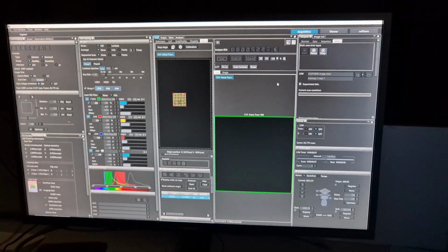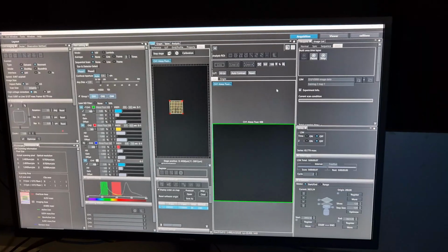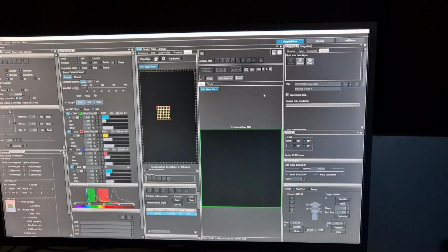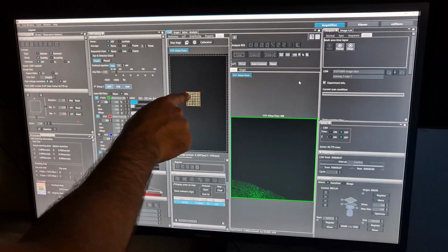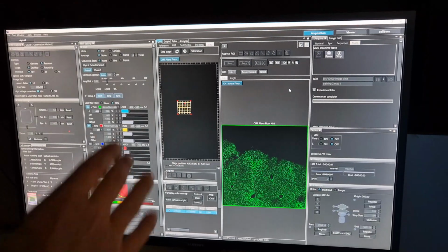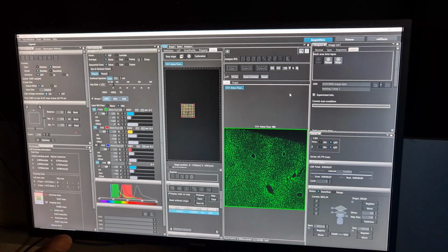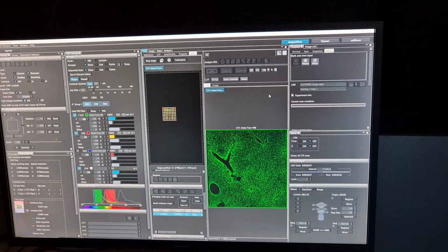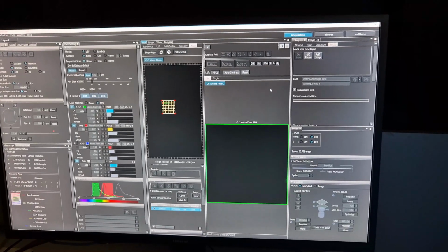Yeah, right. You're going to be doing this, I assume a lot of people are going to be doing maps and then doing other scans. Because what this gives you the ability to do is just do multiple different things programmed across the map. You can change, so in this corner I can do 20x Z stack 2 channel here, 40x stitch area Z stack, also incorporating time, 5 channel thing. I can do something else here with a different zoom and so on. You can just do whatever you want, and then you press go, and it'll just go and do whatever you said. If it says it takes an hour, you can just walk away. You just walk away, yeah, and let it go and do its thing.